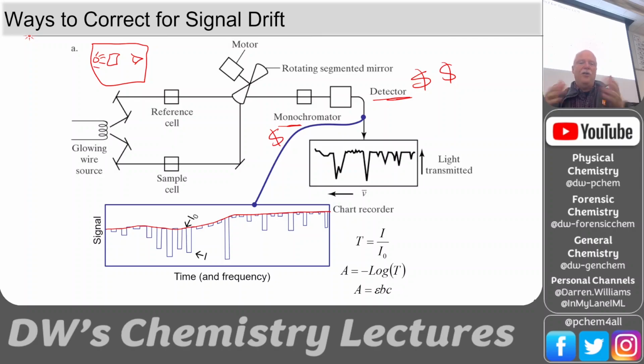Okay, monochromators too. So it'd be nice to just have 1 monochromator and 1 detector, but we've got 2 beams of light. So how do we get them to go through the same monochromator and the same detector? We use this thing called a chopper. It looks like a fan, but it's really not bladed like that. It's got a rotating segmented mirror.